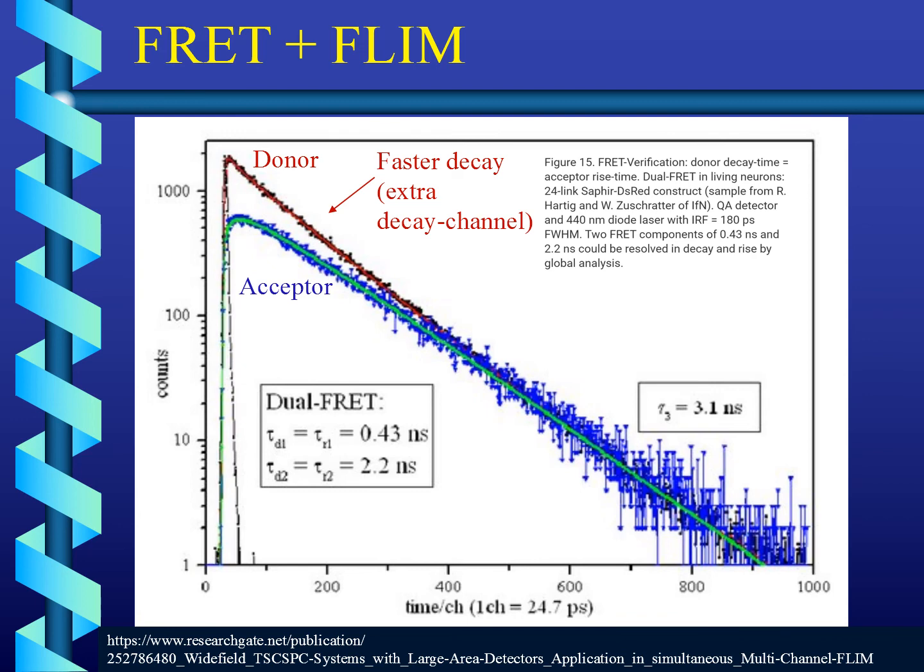But much more interesting to me is this thing, the acceptor rise. So the donor starts with a really sharp kink curve here, whereas this one is a slow rise at the beginning. Well, slow, still very fast because it's a high transfer efficiency. But you see this rise here.